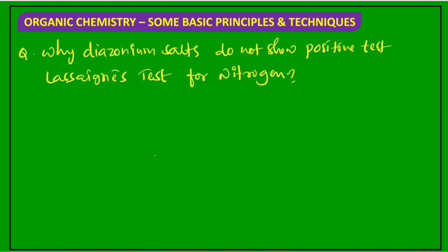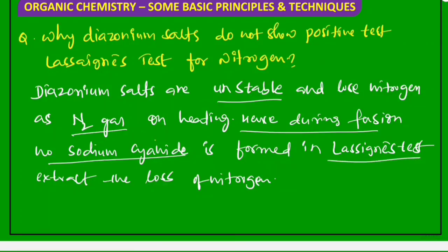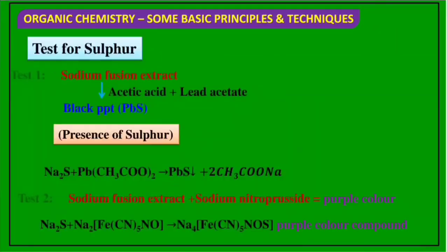Hence during fusion, no sodium cyanide is formed in the Lassaigne extract, due to the loss of nitrogen.